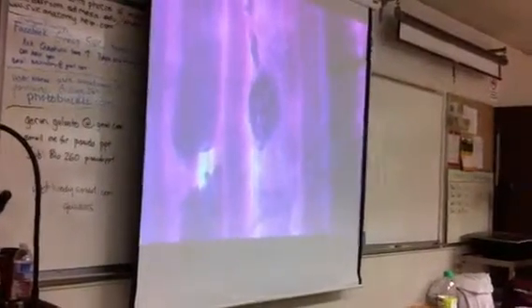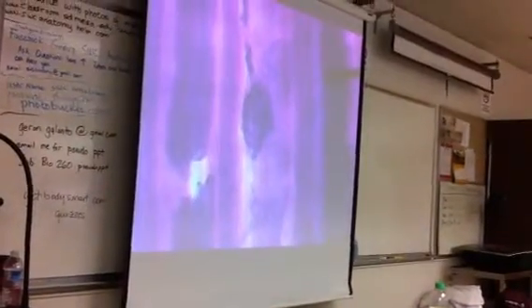The slide says neuromuscular junction, and it just shows you what the little connection is between the nervous system and the muscles right there. That's one of them, and there's other ones on there. That was a good one.